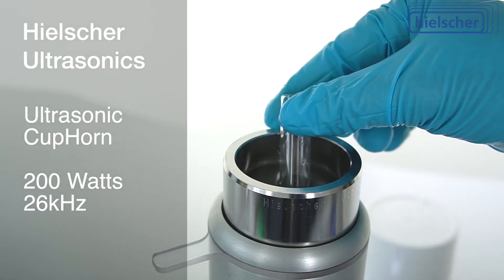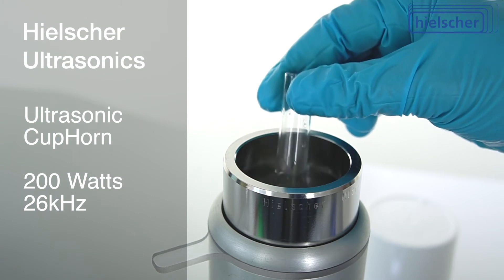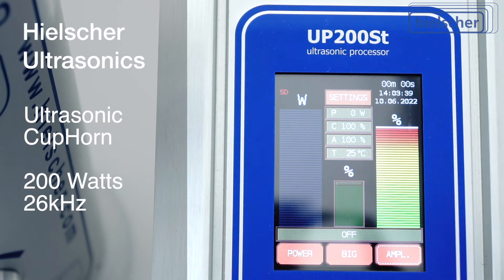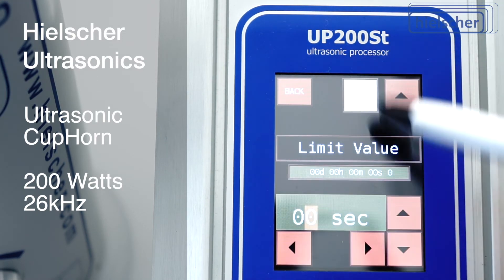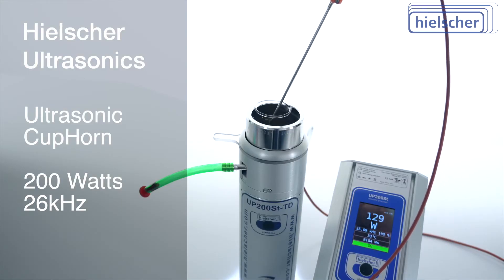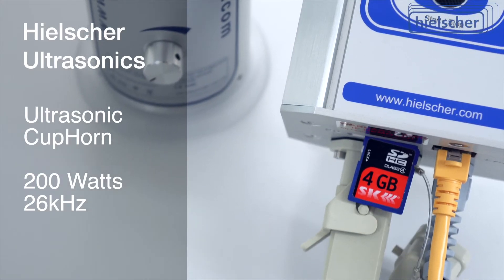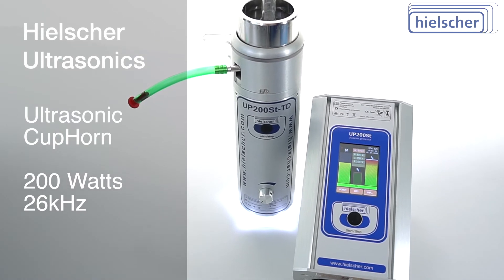The maximum ultrasonic power of 200 watts and the ultrasonic amplitude of 10 micrometers can be precisely adjusted on the colored touchscreen of the generator. An adjustable timer and cycle function are included as standard, as is the PT100 thermal sensor for recording and logging the temperature and the SD card.